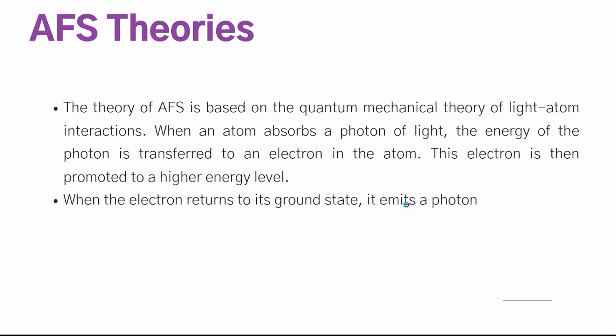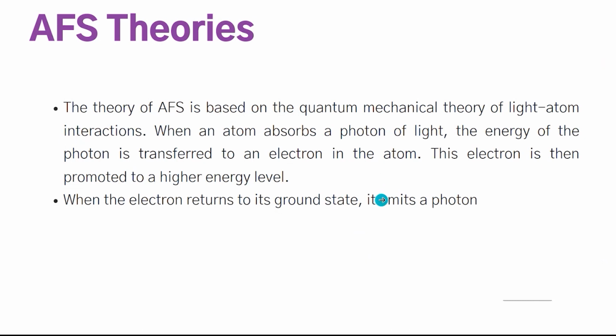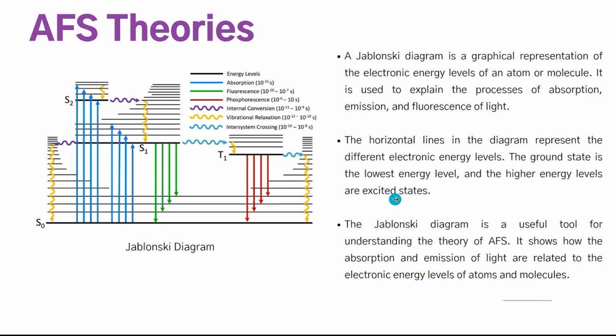So, the theory of AFS is based on the quantum mechanical theory of light atom interactions. When an atom absorbs a photon of light, energy of the photon is transferred to an electron in the atom. This electron is then promoted to a higher energy level. When it returns to its ground state, the electron emits a photon. So this is a diagram called a Jablonski diagram, which is a graphical representation of the electronic energy levels of an atom or molecule.